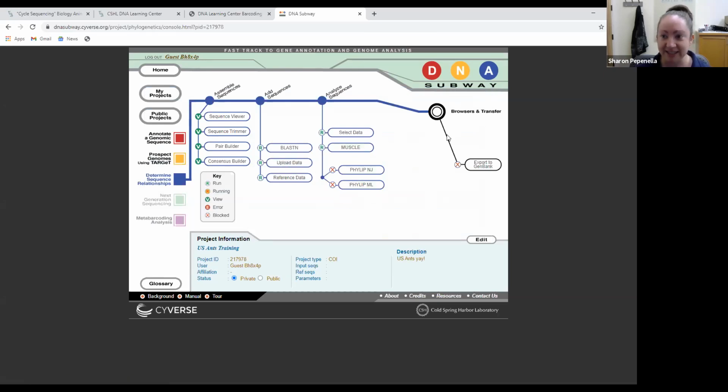So that's BLAST, that will be the identification aspect of your particular species. Is everybody with me? Mary, go ahead. One quick question. Okay, so you said that you either sequence the forward or the reverse, not both. How do you know which one to pick?